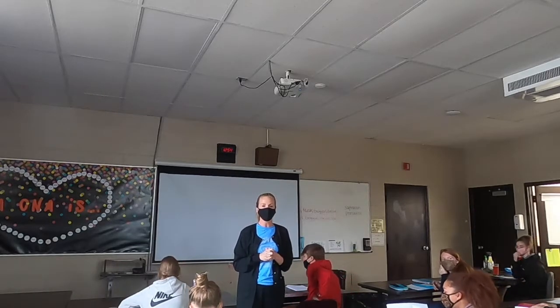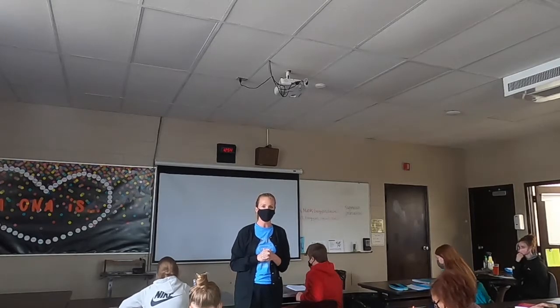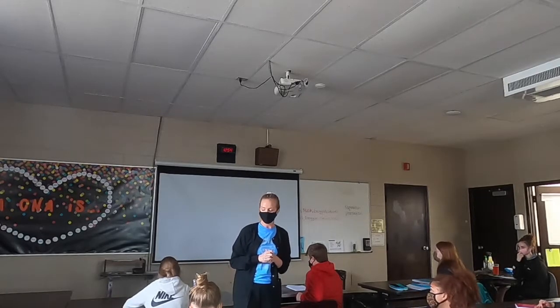We are going to be showing the performance skill video for applying and removing PPE, personal protective equipment. So here we go.